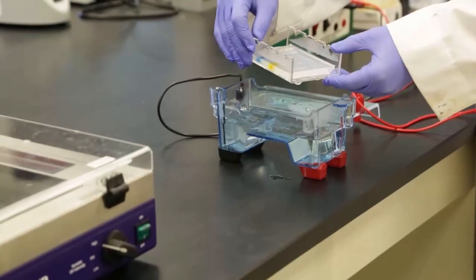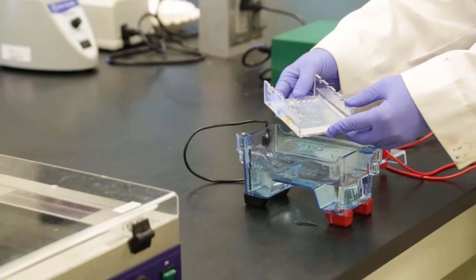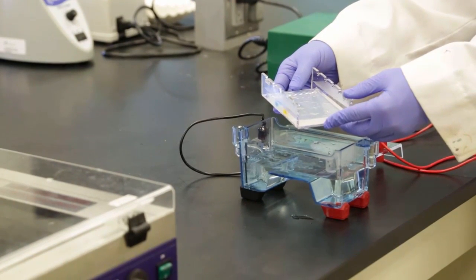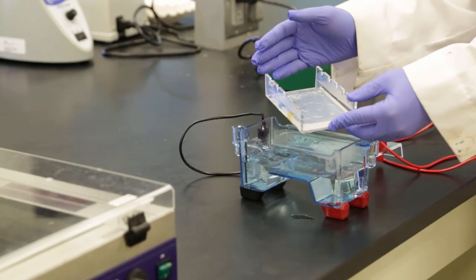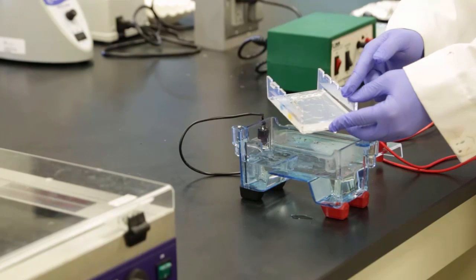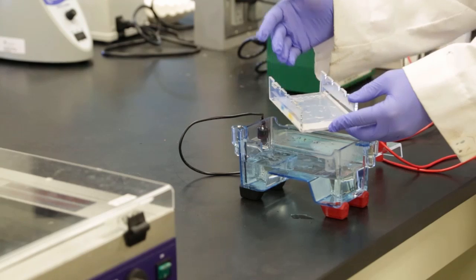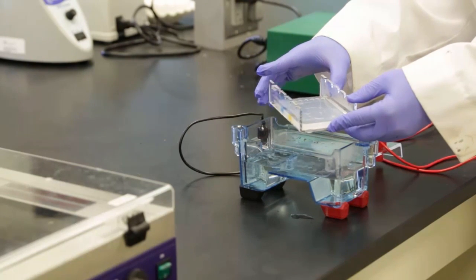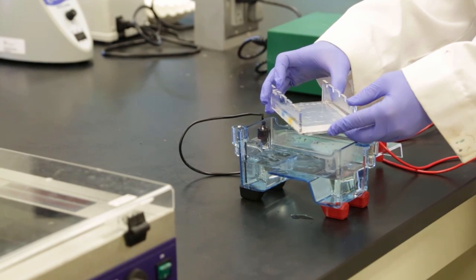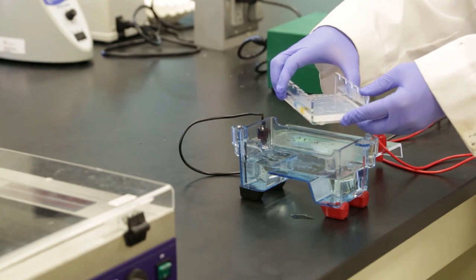The bands that you see in the gel show only the movement of the loading dye. It is not indicative of DNA being present or absent. It just shows you that an electric field was generated and that the loading dye was able to move down the gel. So now, because I've added SYBR Safe to the gel, I'm going to add it to a UV table, turn on the light, and if there is any DNA present, we should see some glowing bands, each band representing a separate DNA molecule.